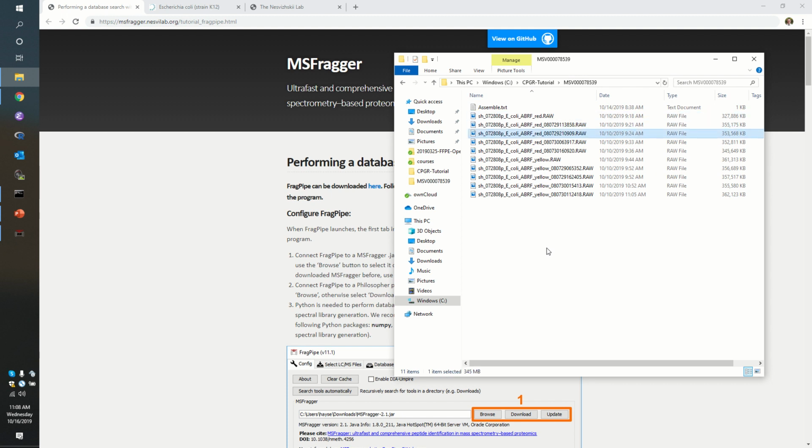So you can see that there's a bit of metadata that's visible right there in the raw file names. You see that these first 5 are all called red, and these last 5 are all called yellow. So we've given you a hint in the file names just how these things split into 2 cohorts.